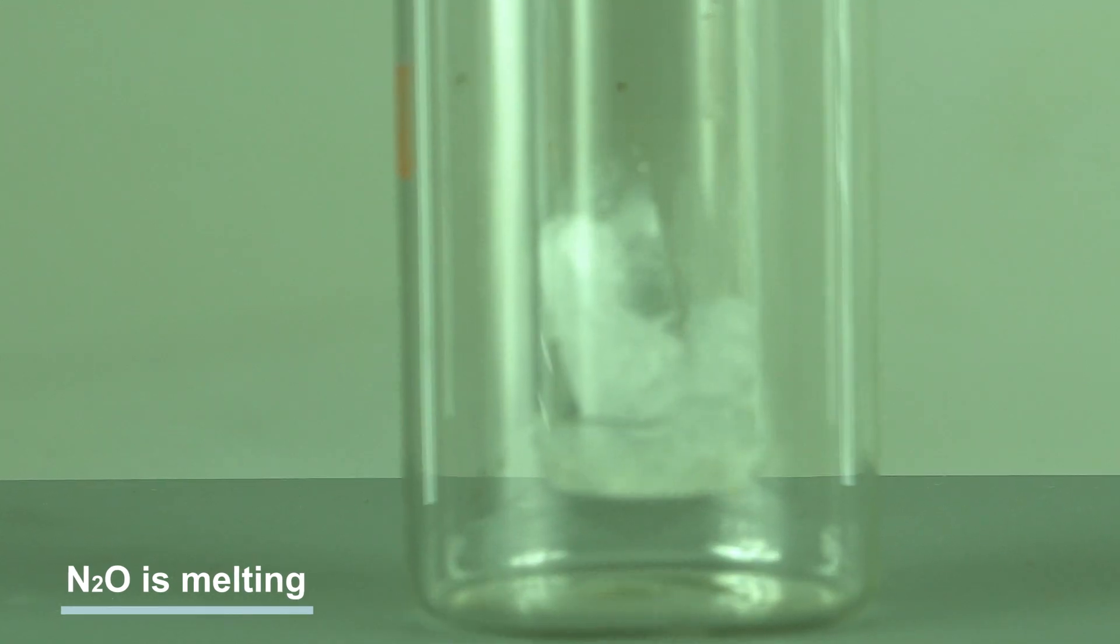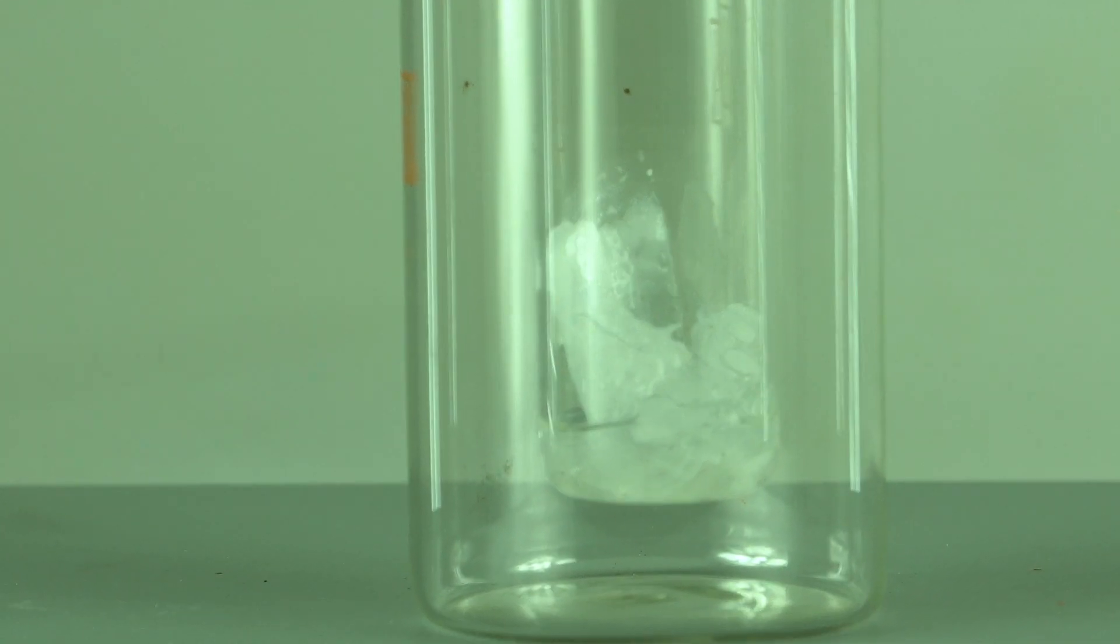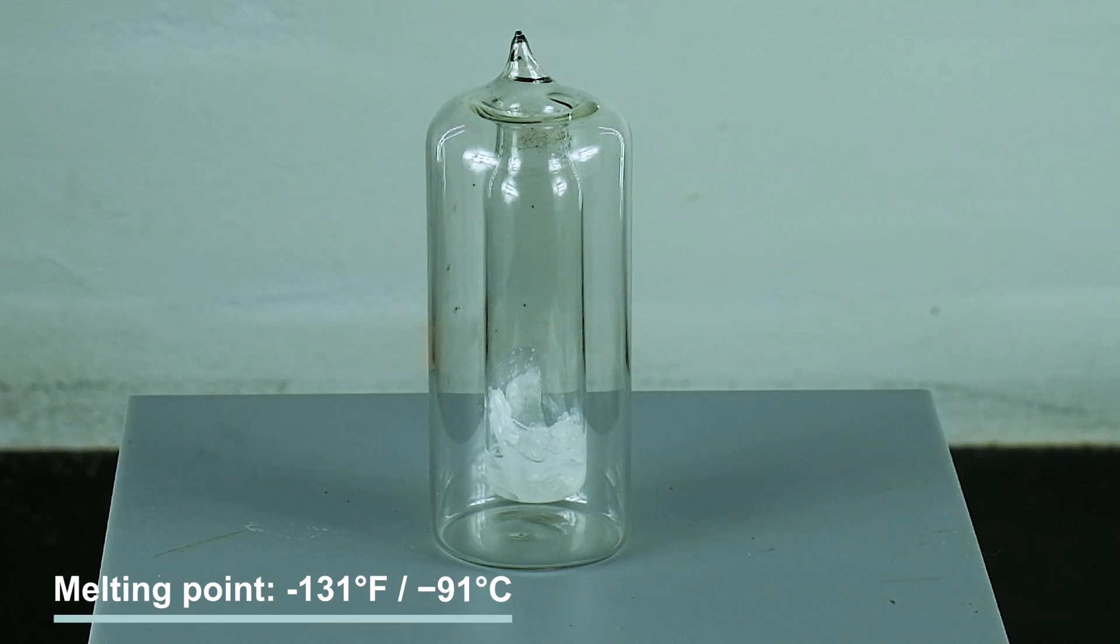To be precise, the melting of which you can see now. Nitrous oxide freezes at minus 131 degrees Fahrenheit or minus 91 degrees Celsius.